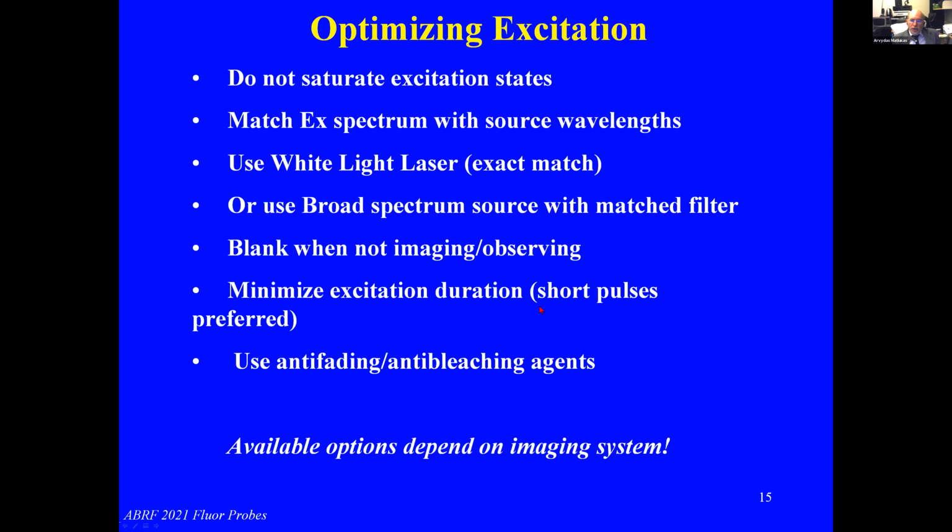I will show in the next slide special software, the spectral viewers and databases are available for that. Then we need matching probes to the available excitation sources and filters, and the availability of sources can be laser, LED, or traditional mercury light source.